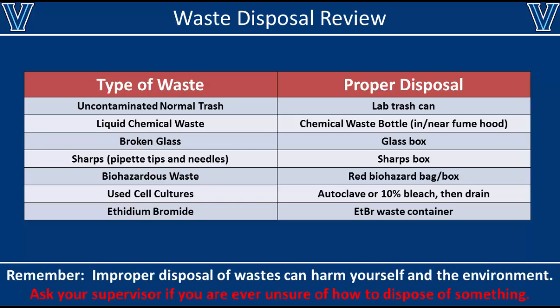Remember, if you have any doubts or uncertainties on how to dispose of a waste that you generate, contact your supervisor to find out what you should do. Otherwise, you might harm yourself or the environment.